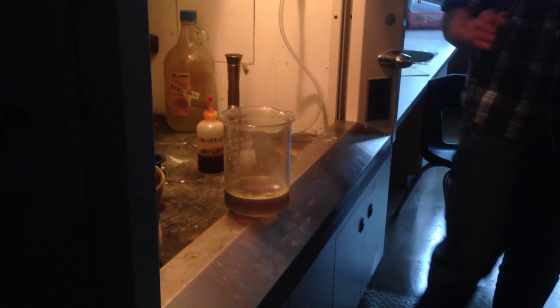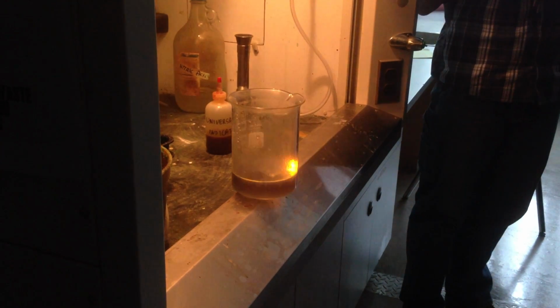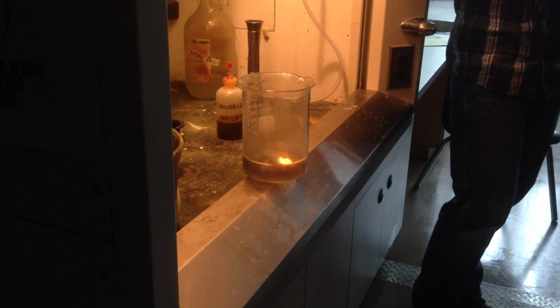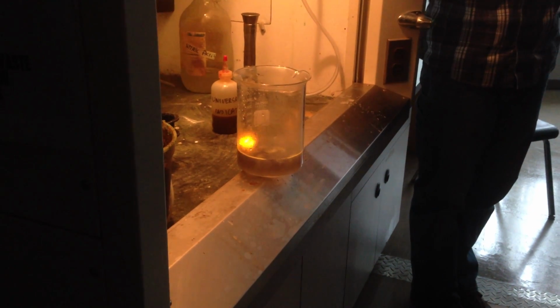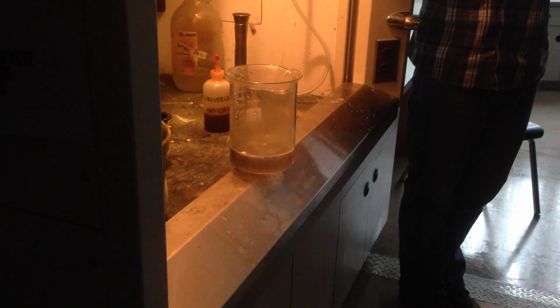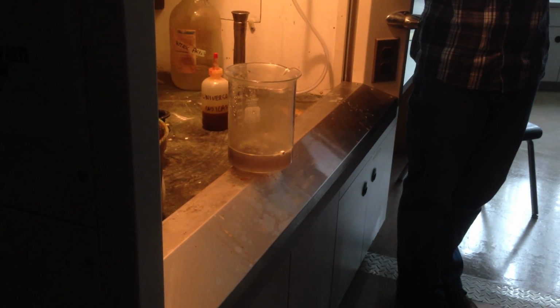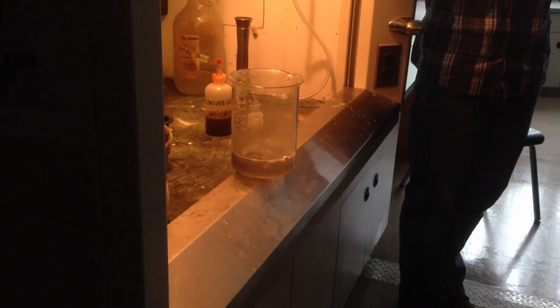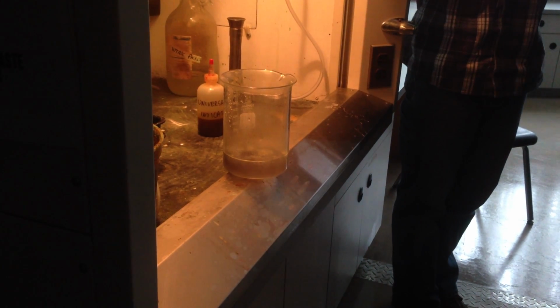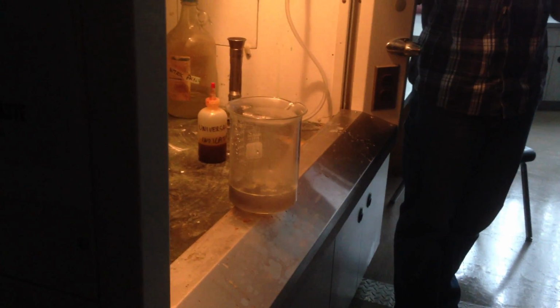Okay, so we drop that guy in. Same basic reaction, but a bit more violent. It's releasing energy a lot faster, and it's warm enough that the hydrogen that comes off in all of these reactions is warm enough to ignite. And so we get those little flames. Maybe it'll ignite again. That's kind of cool. Again, it is dense enough to sink, but it's its own little hovercraft, which is kind of cool.